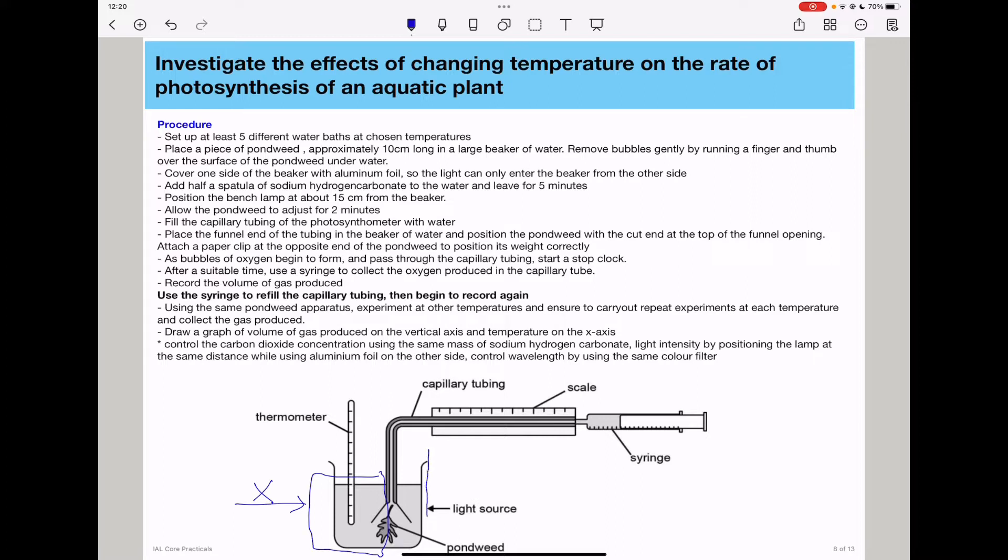We will position a color filter between the experiment and the light source to ensure that the plant is exposed to the same wavelength of light. The procedure is as below. Set up at least five different water baths at chosen temperatures.